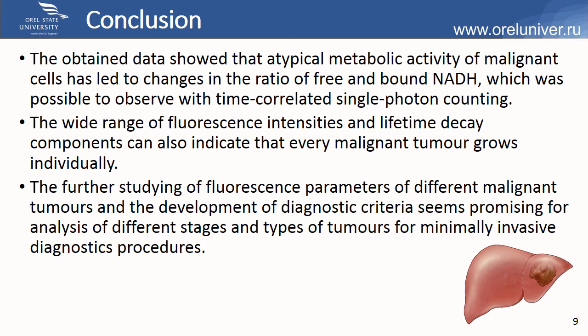In general, this study shows that further study of fluorescence lifetime parameters seems promising for development of additional diagnostic criteria to introduce them into algorithms of minimally invasive diagnostic procedures.